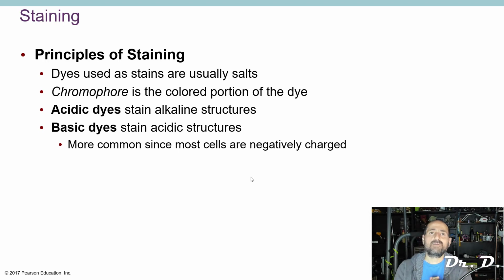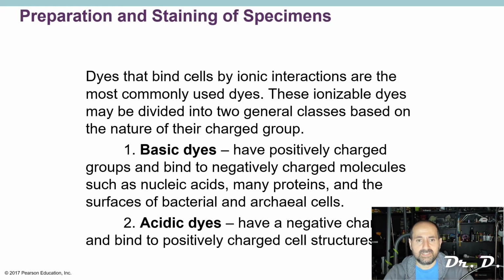Does that make sense? So let's say I'm trying to stain E. coli. I wouldn't use an acidic dye because I know my E. coli have a negative charge. I'd want to use a basic dye. Does that make sense? Because basic dyes, or alkaline dyes, have a positive charge. So most dyes that you are going to use in the microbiology lab are basic dyes. Okay, and that's true.